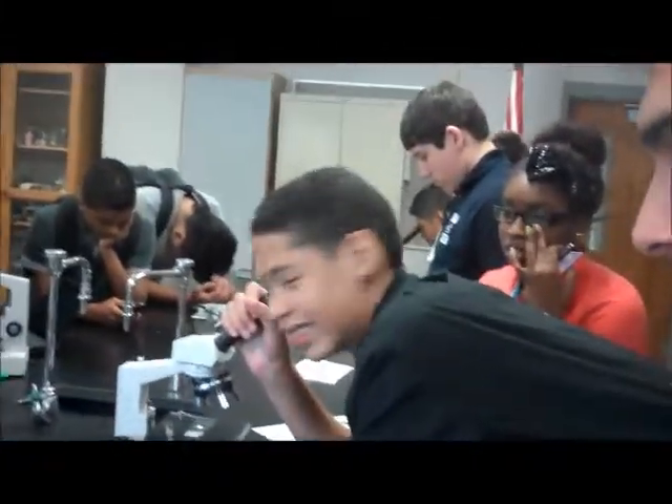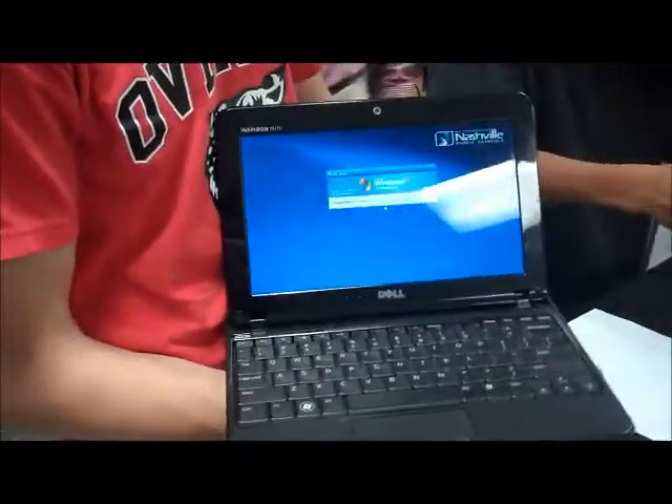You already have two videos. Yeah. And we need three. What we're doing here is he's working the microscope. We're going to do the steps, looking it up on this mini Dell.